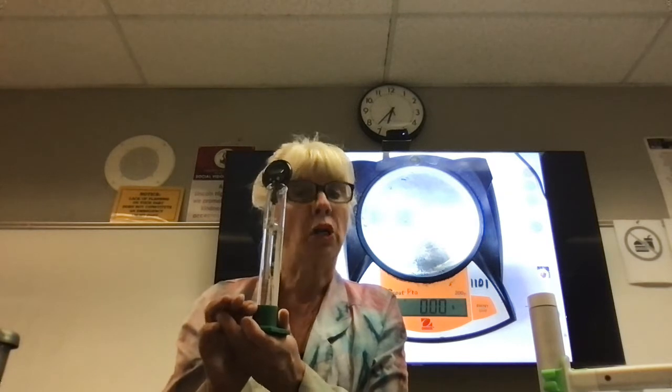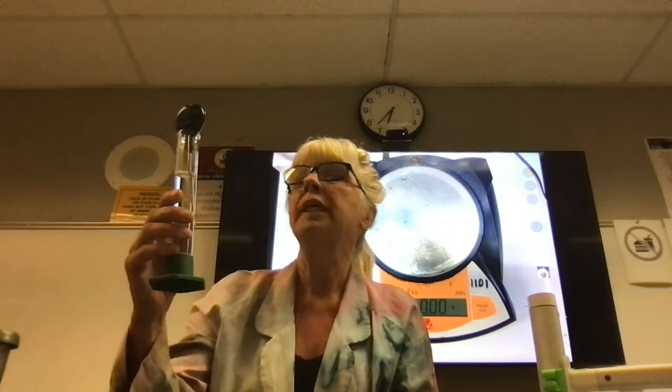Hi, it's Mrs. Mafucci, and I'm going to do the reaction between calcium and water as a demonstration for those of you who were not here to actually do the lab. In the first step, we have to put exactly 50 milliliters into a graduated cylinder and measure its temperature. I just put some tap water in here, filled it up to the 50 milliliter mark, and it's reading a temperature of 18.6 degrees.